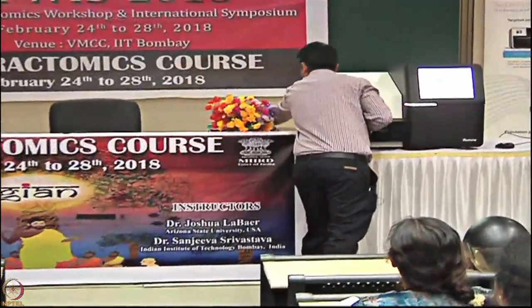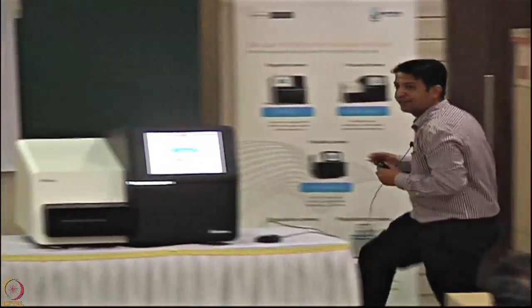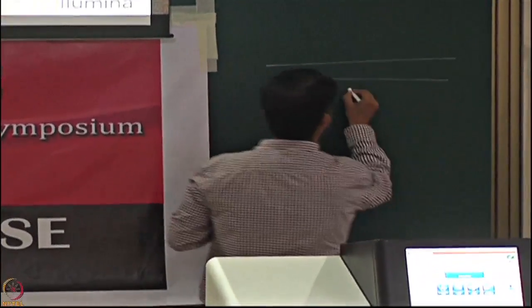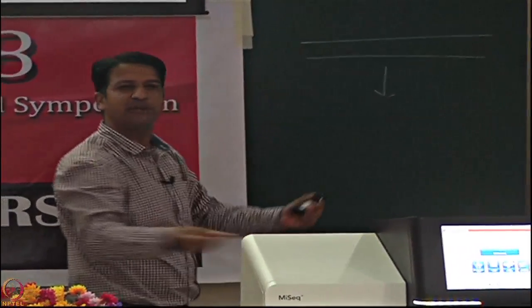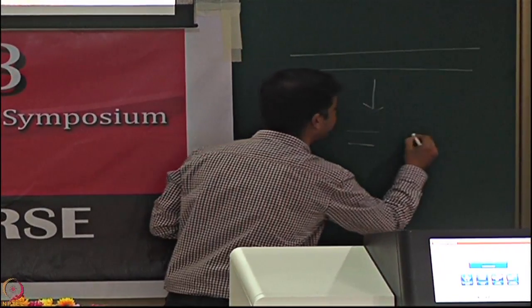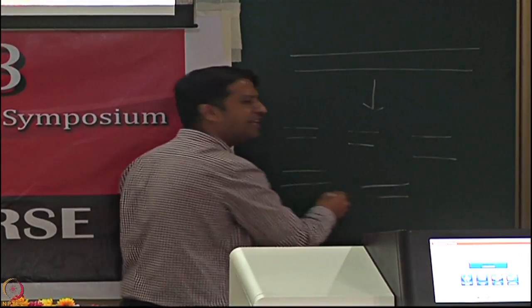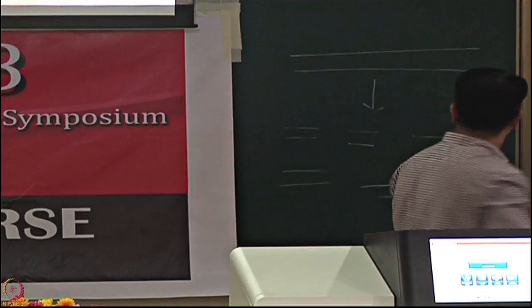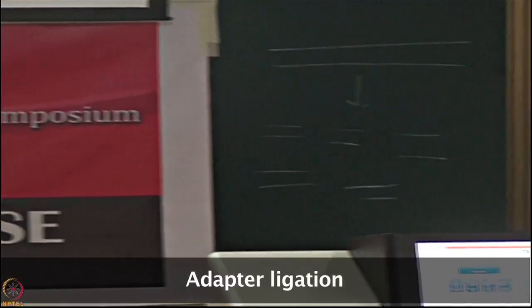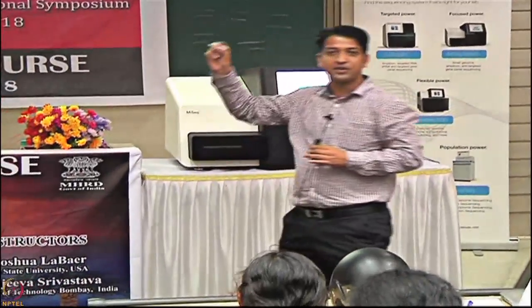Again, the same question I'm asking. Let's say there is a human genome. In Sanger, with any genome, human genome, big genes, the first step is we fragment it into various small fragments. Let's say 600 base pairs, we'll chop it down into millions of fragments. But these are unknown. So to get them sequenced, what do we need? Right, you remember now.